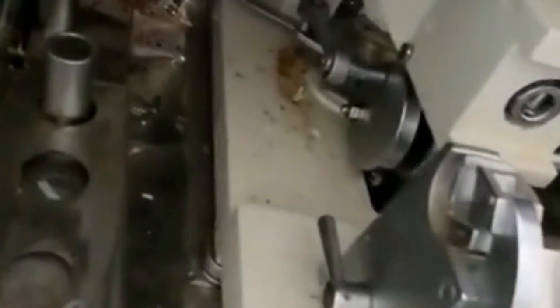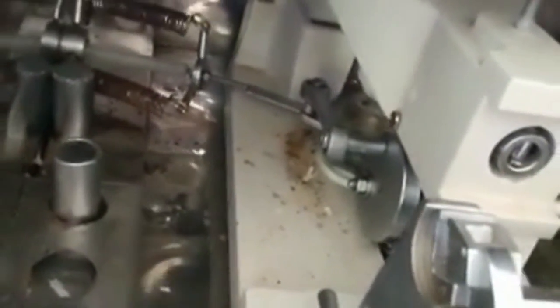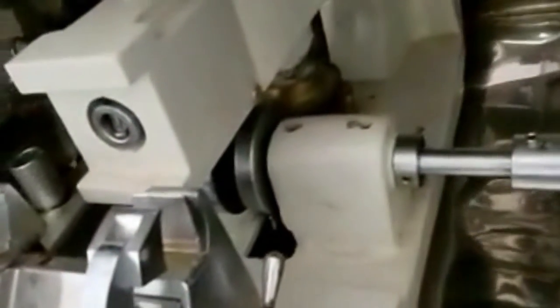The cryotome consists of an objective to place the chunks containing frozen tissues, a stage to hold sharp cutting blades, and an advancing or retracting mechanism.